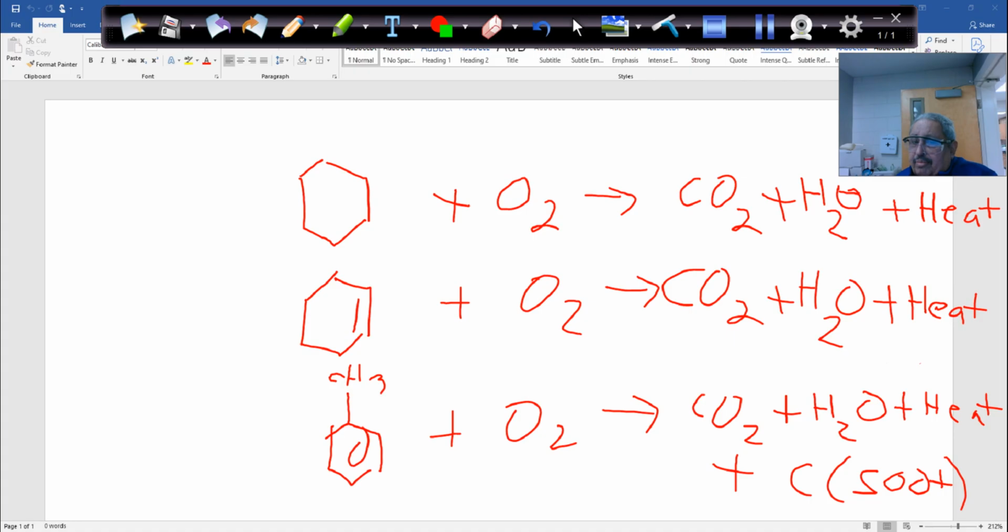So with this in mind, you can tell me whether your unknown, A or B or C, is cyclohexane, a cyclic alkane, cyclohexene, a cyclic alkene, or aromatic toluene. You are telling me what it is. I have the key from the lab supervisor. I'll give you 10 points for this. If your unknown is not correct, you'll get 90 on your lab report. If your unknown is correct, then you'll get 100. Okay, guys? Any question? I'll stop recording here. So let's start with the lab.